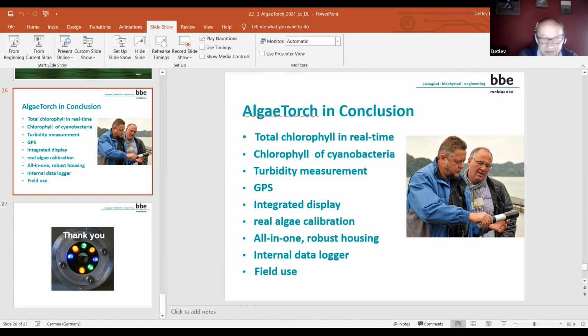Some scientists believe, that's not my opinion, but some scientists believe that in reality, you will not find the phaeophytin at all. So that means that it is an artifact of the laboratory, but I'm not a specialist because I do not use this laboratory method. I prefer to do the fluorometric approach. And I think this is now the answer, of course. I hope I understood it right.